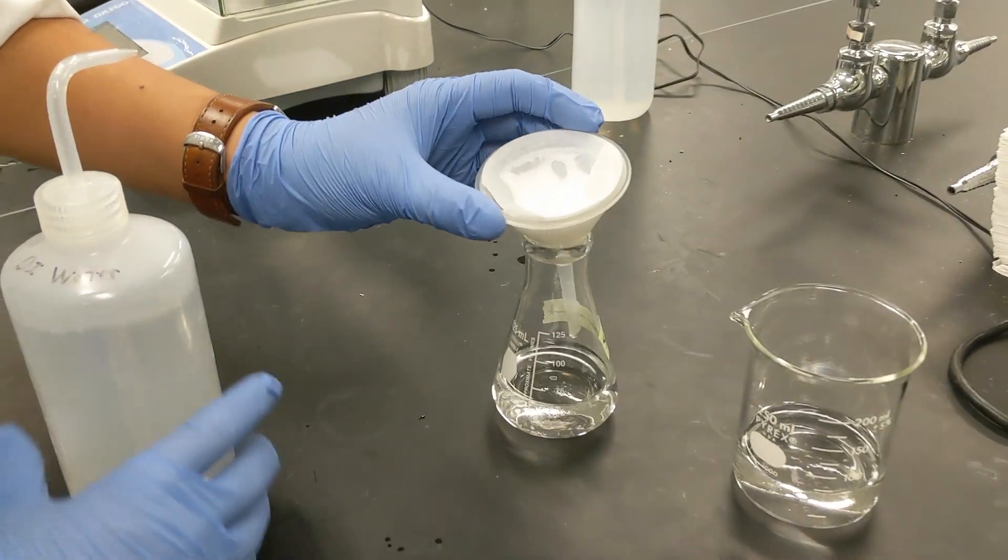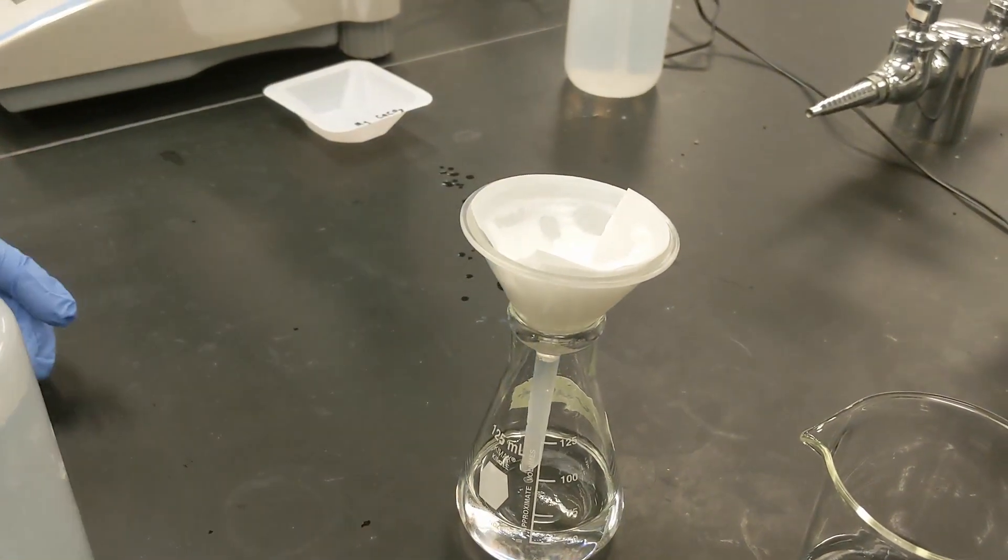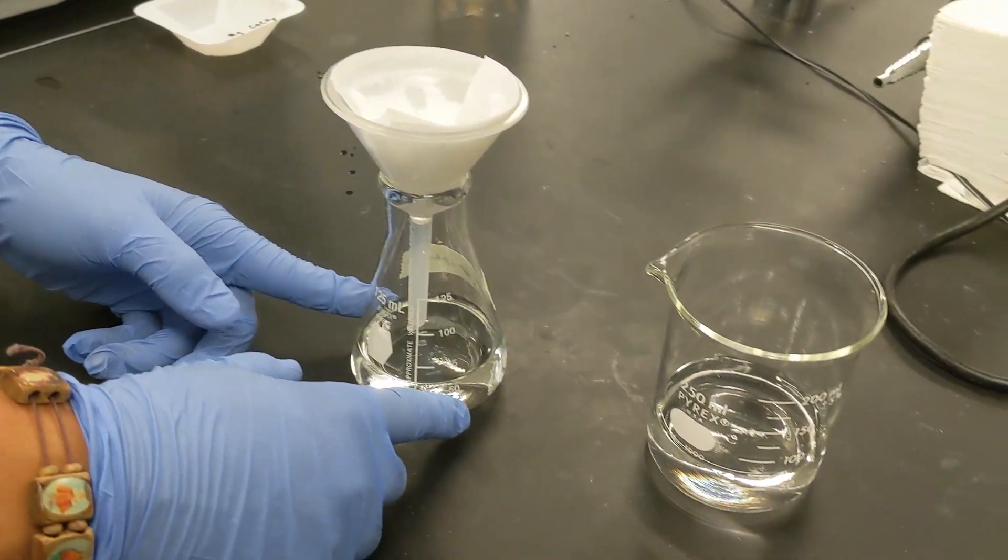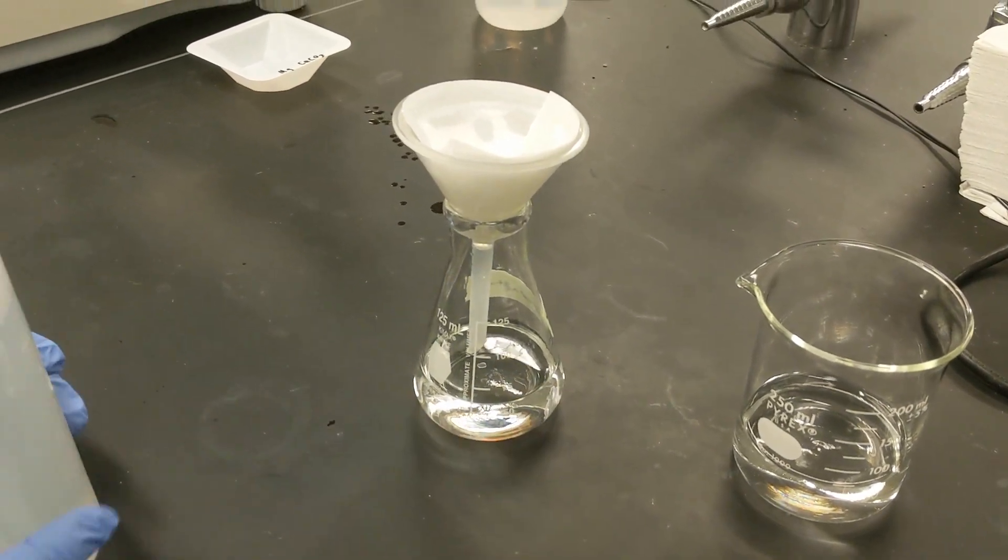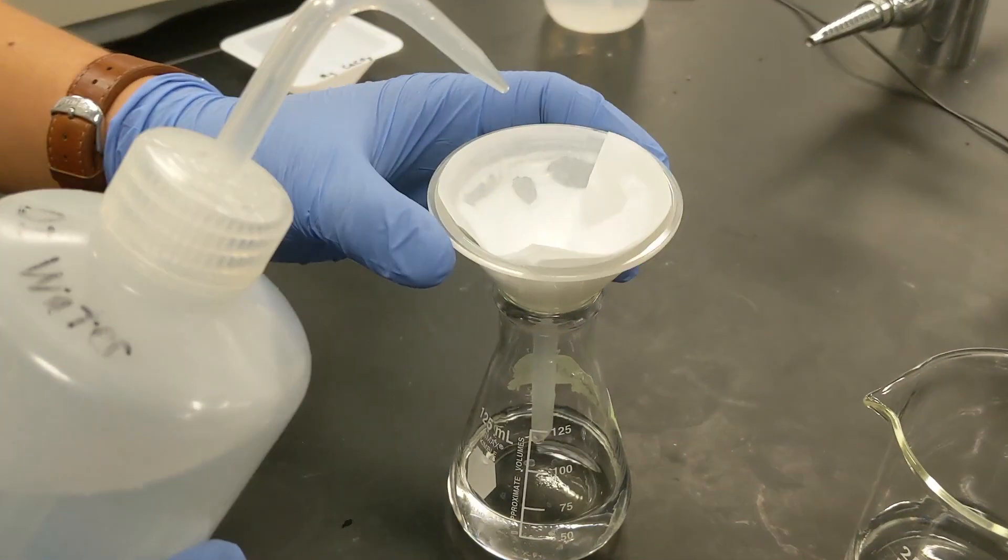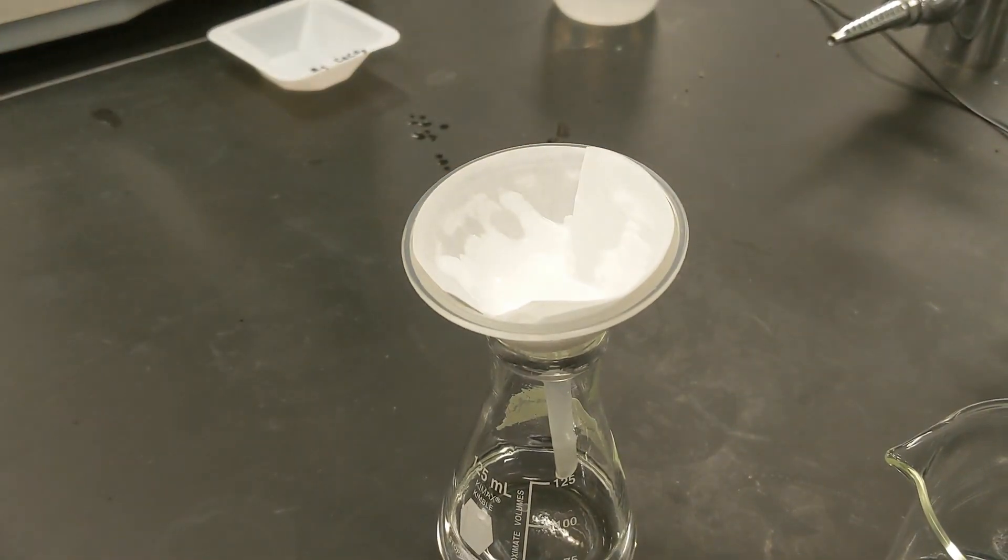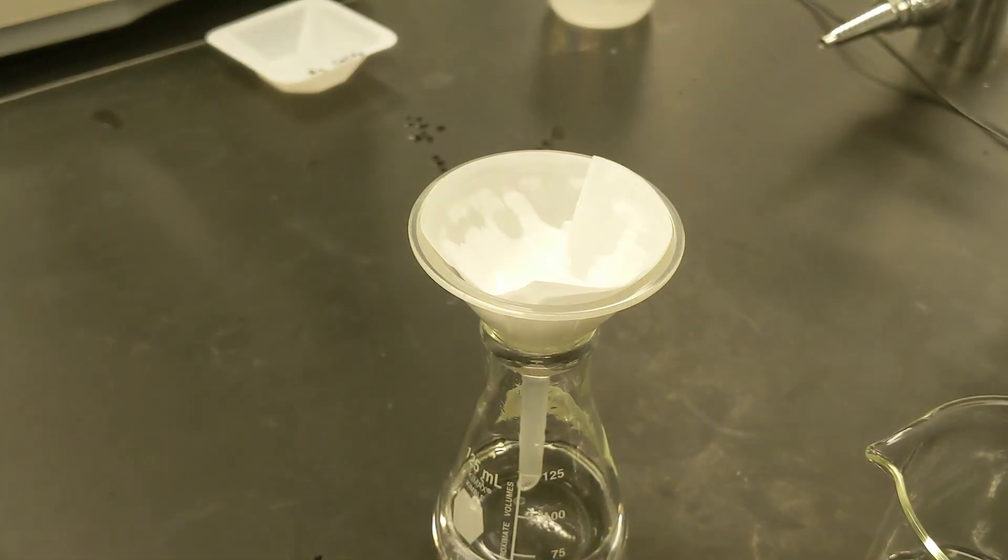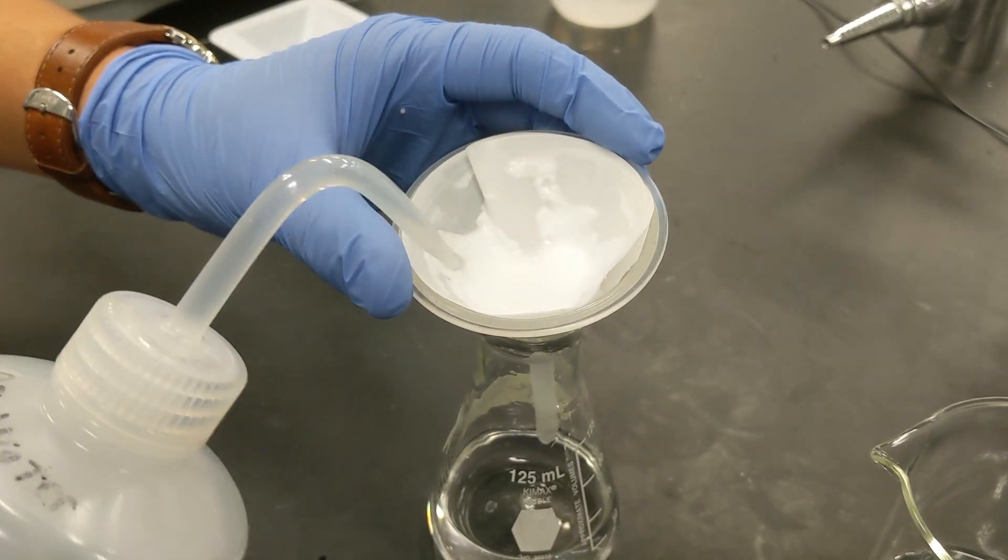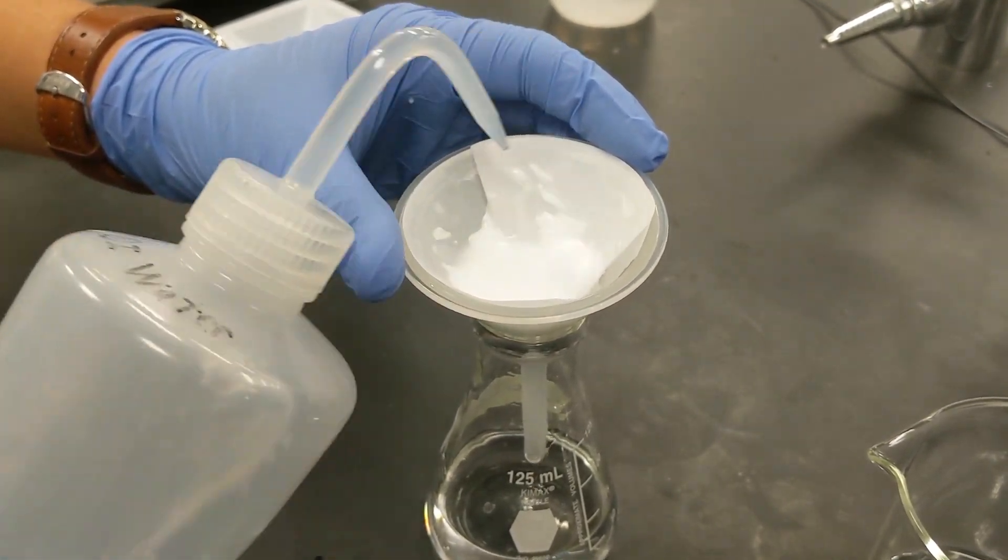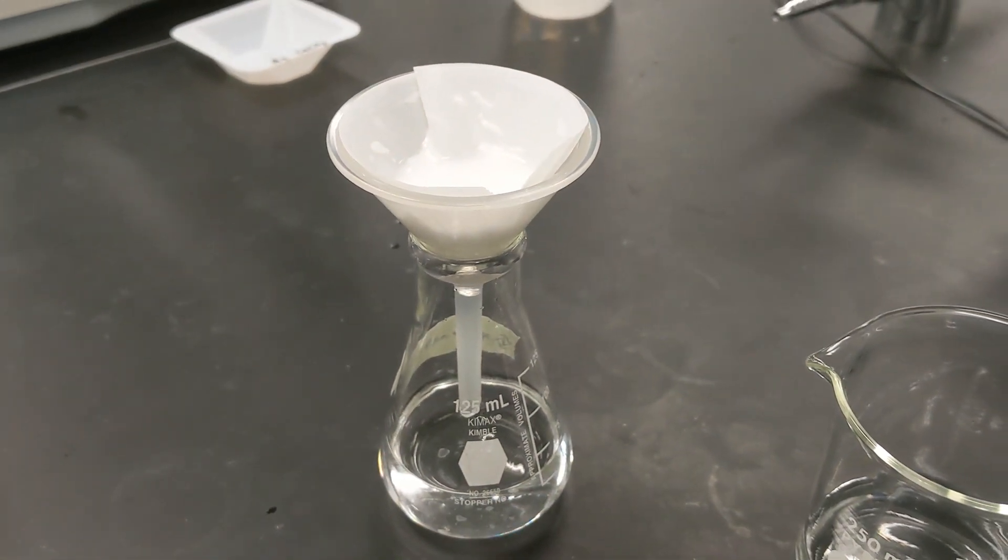So now that most of the supernatant has drained and we have our precipitant in the filter, what I did was transferred some of the new supernatant from the Erlenmeyer flask into another beaker, just because this is going to continue to get full. Because we're going to add a little bit more DI water to this just to finish washing it out. I'm going to do a few little rinses here. One or two or three is fine. So we'll just finish rinsing it out. And we'll let that continue to drain and then we'll move on from there.